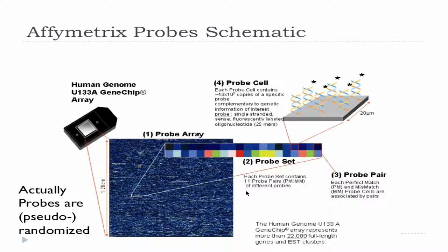And these probe pairs were designed in a very specific way. If we had the sequence for a transcript, we would get these 11 probe positions, 25-mers typically. We would design those. And then in order to account for non-specific hybridization, Affymetrix built a separate, or a related, set of probes called mismatch probes. The mismatch probes and the perfect match probes were identical except for one base in the middle, one base wobble in the middle.